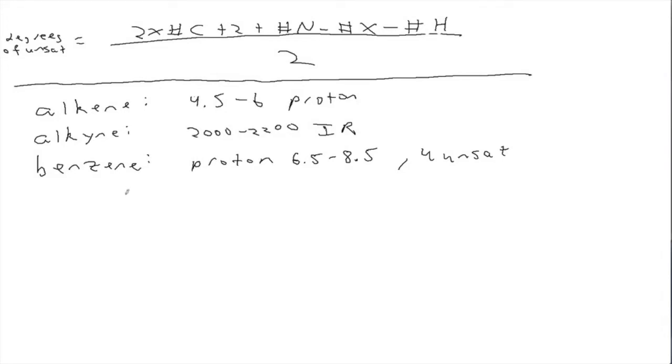So let's say that there's an oxygen in the compound. What types of functional groups could an oxygen be in? What's one type of functional group that could have an oxygen? Alcohol. Or carbonyl. So alcohol may be most important. How would we detect an alcohol from our spectroscopy data? What's the most useful signs?